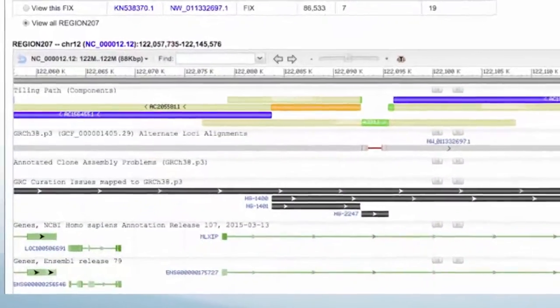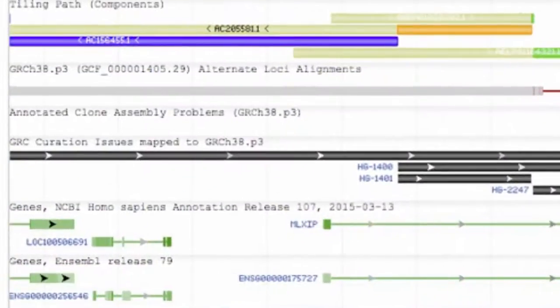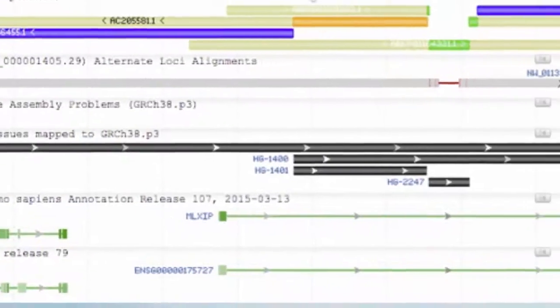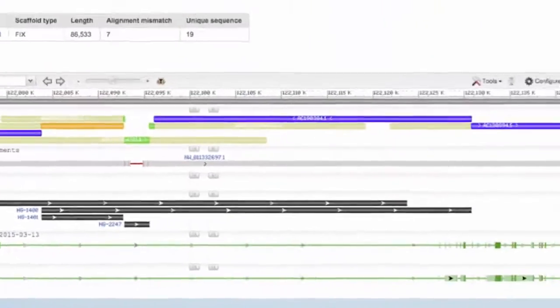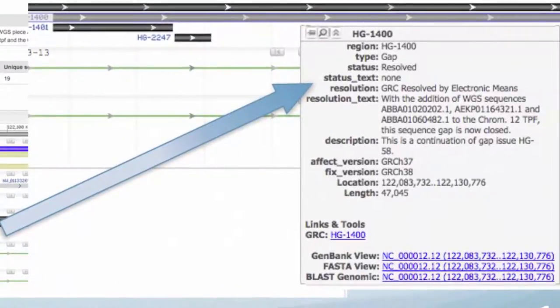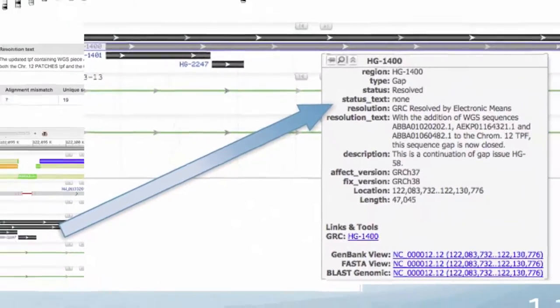As you can see, there are some areas with information on the curation of regions. And if you click on one of them or just hover the mouse over the region, the information on these agreements between sequences will be displayed.